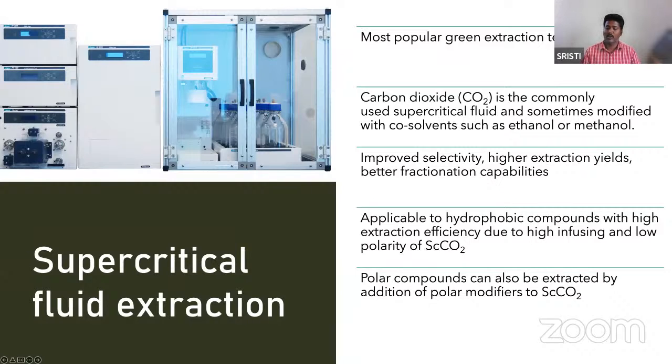It is applicable to hydrophobic compounds. Those compounds which are hydrophobic in nature can be extracted with high efficiency by tuning the polarity of supercritical carbon dioxide. Polar compounds can also be extracted by the addition of polar modifiers like ethanol and methanol.